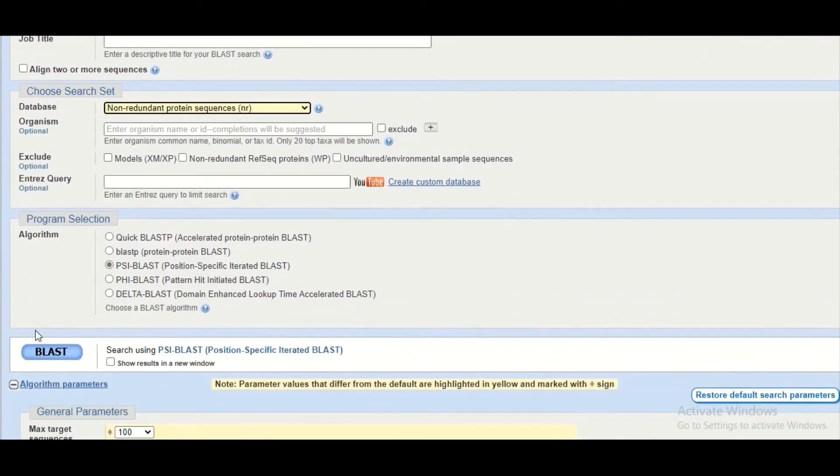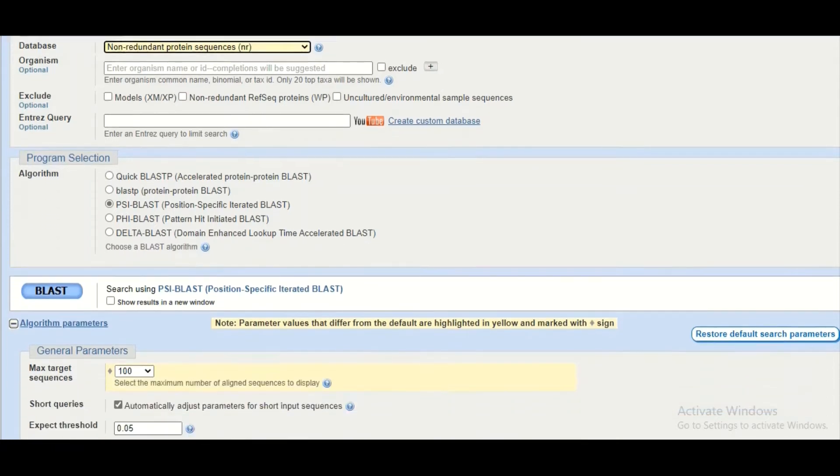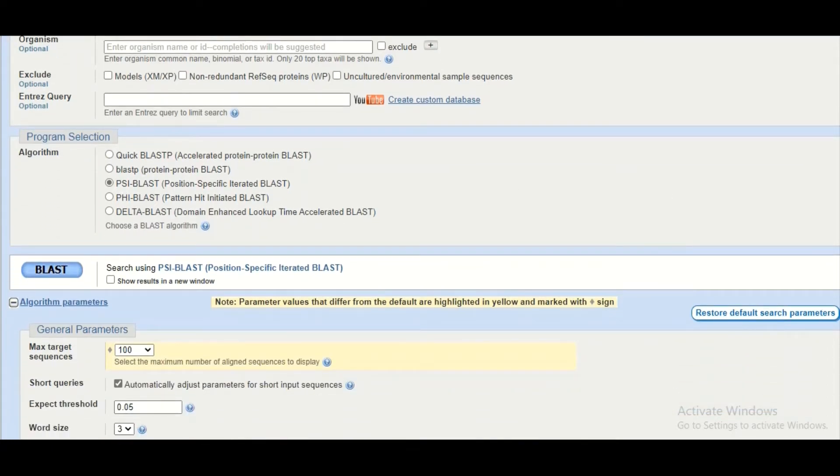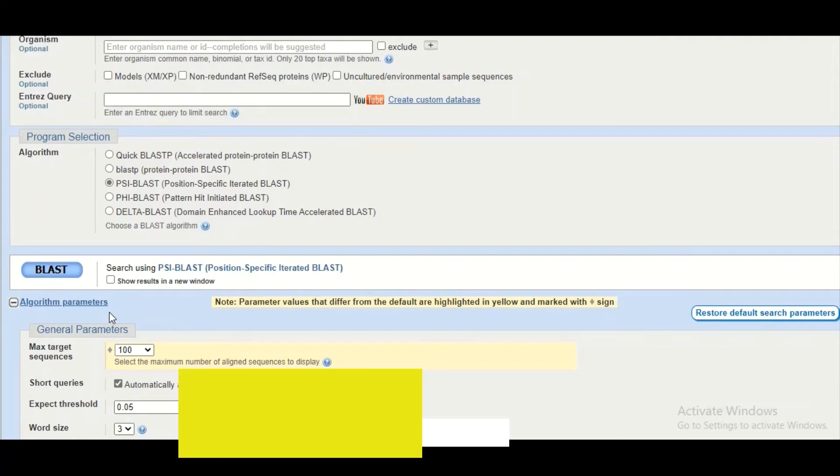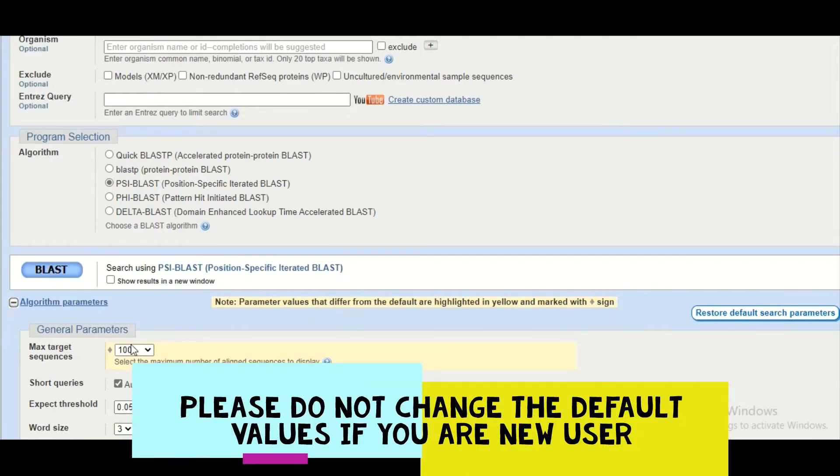Then at the bottom we are going to select PSI-BLAST. You can simply hit the BLAST button and you can change the algorithm parameters.